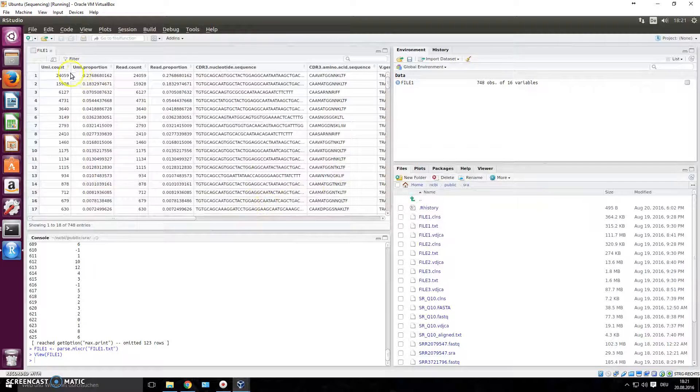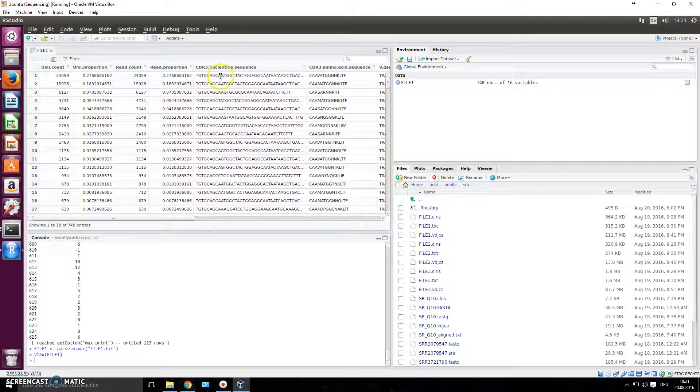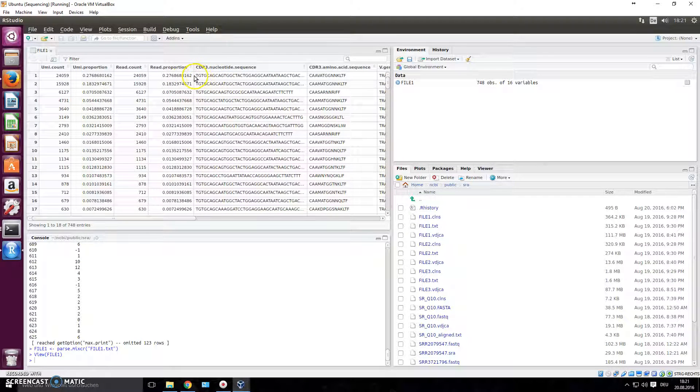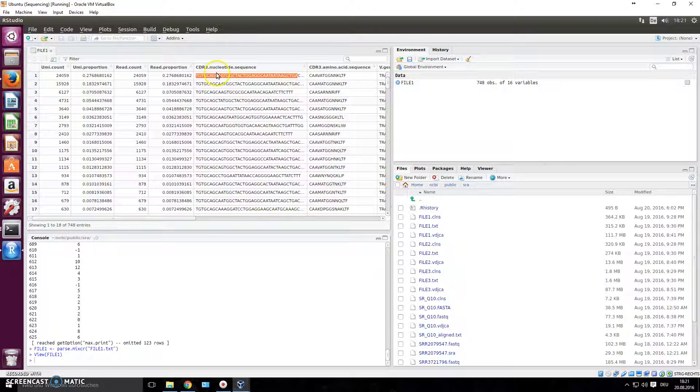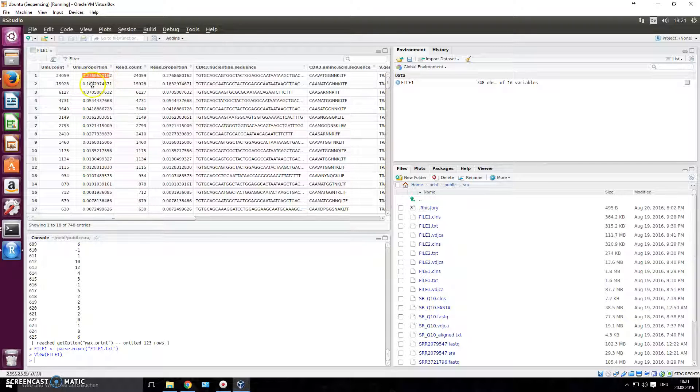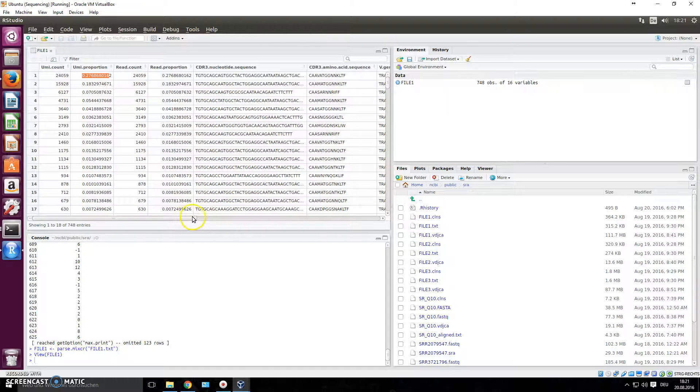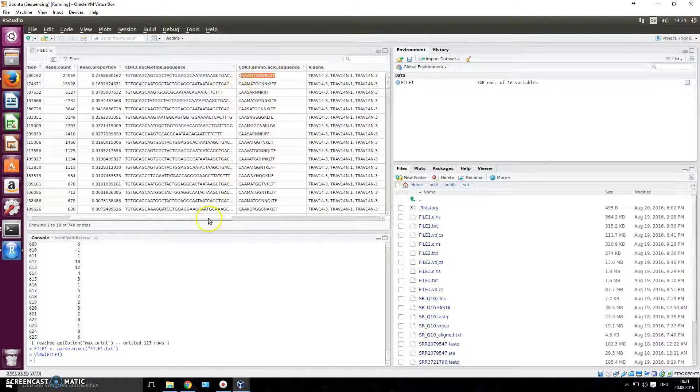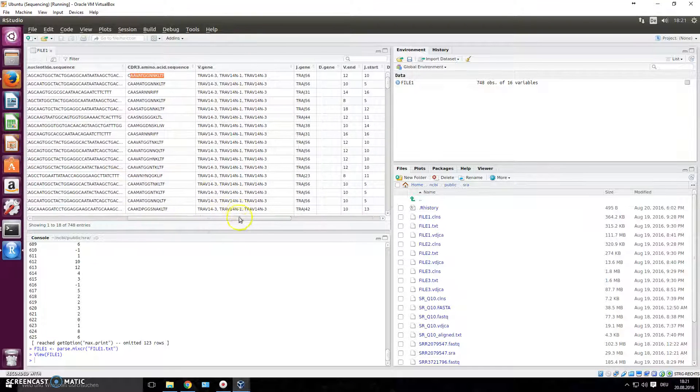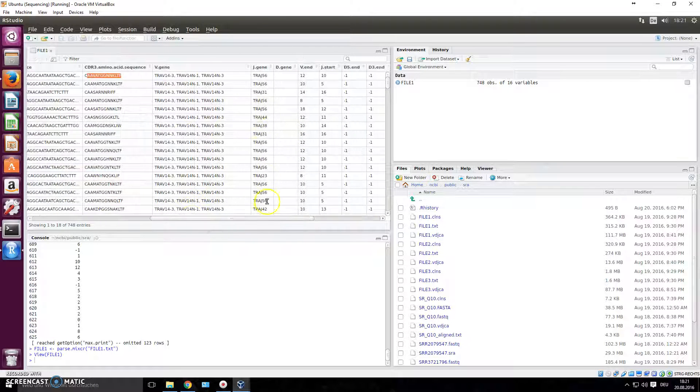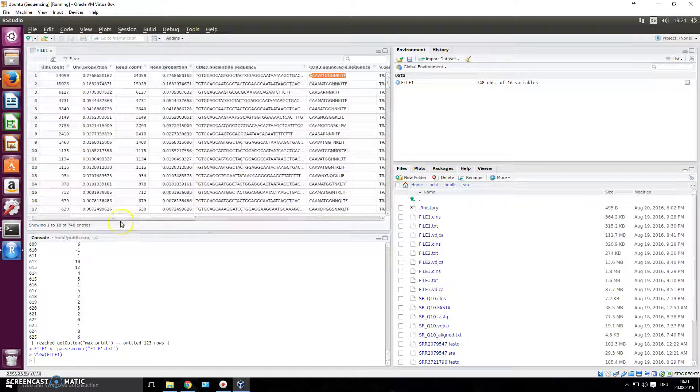You see it parsed it, and now you have every clonal type. It looks at a CDR3 region, which is the most important region when you look at tcR data. It has parsed this data and it gives you the count. For example, this clonal type occurs 24,000 times and makes up 27% of that whole repertoire. And you know, this is the amino acid sequence of that CDR3 region. These are the V genes used - or this is the V gene used - this is the J gene used. So these are the informations that you get from there.